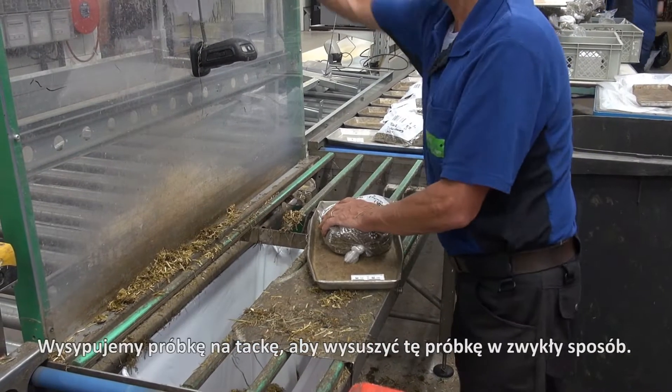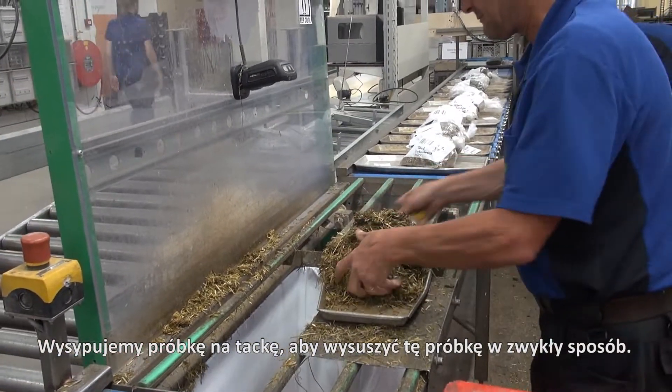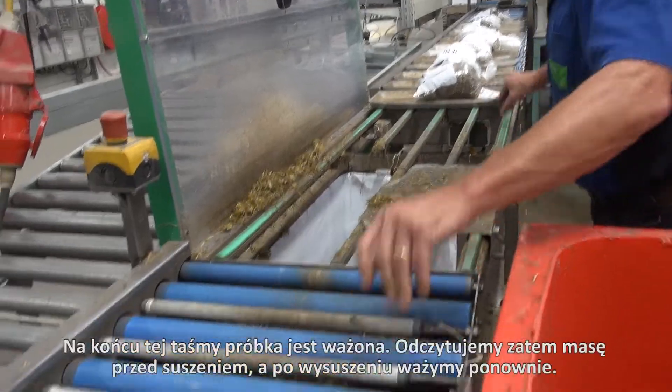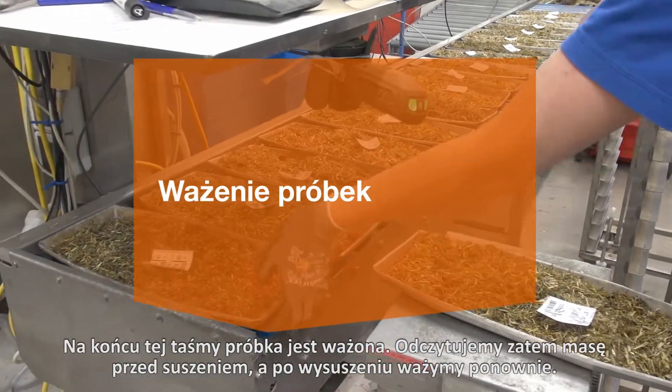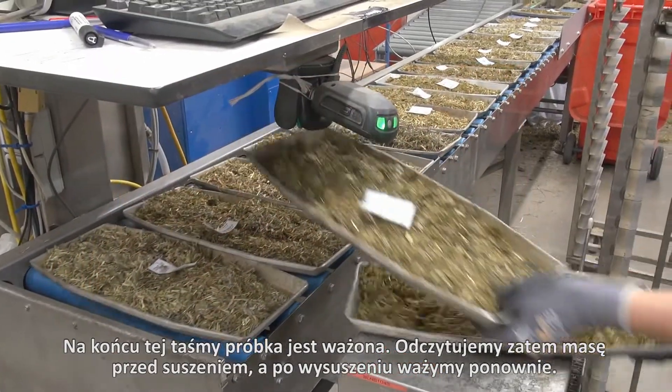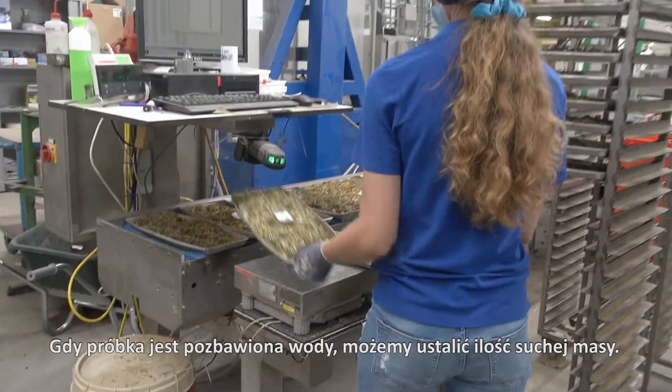The bags are being opened here. On the little plate we spread out the sample so that it can be dried in a normal way. At the end of this belt the sample is being weighed, so we have the weight pre-drying and after drying we weigh it again. Then we have the sample without water and we can measure the dry matter.